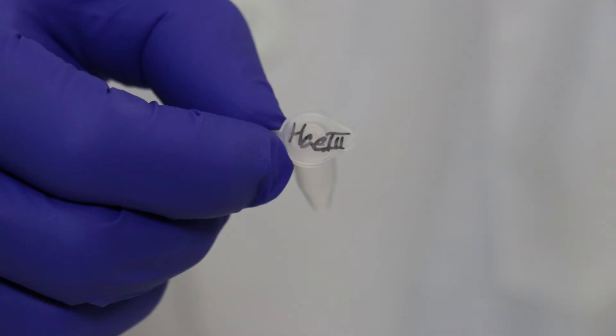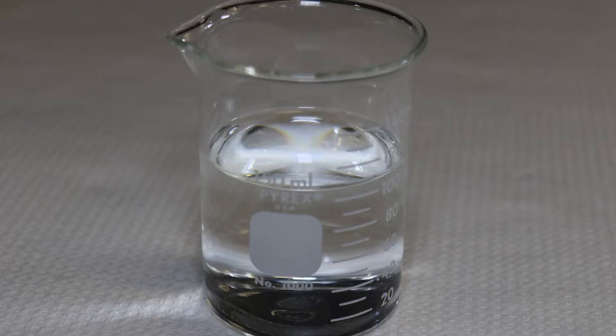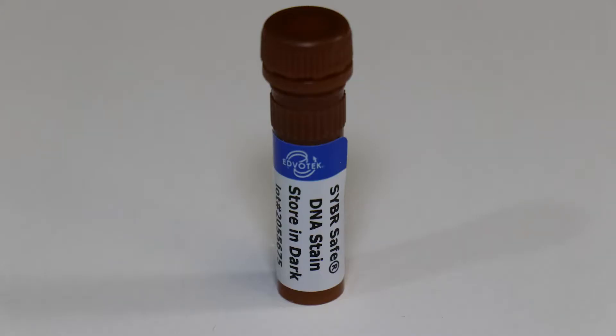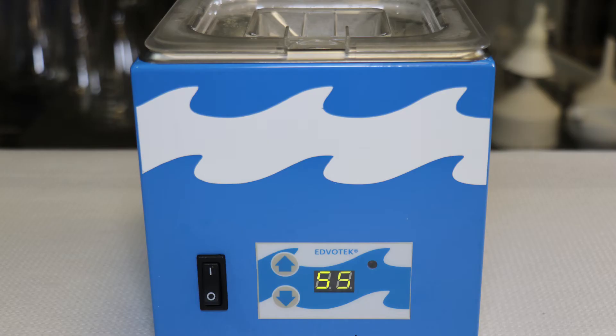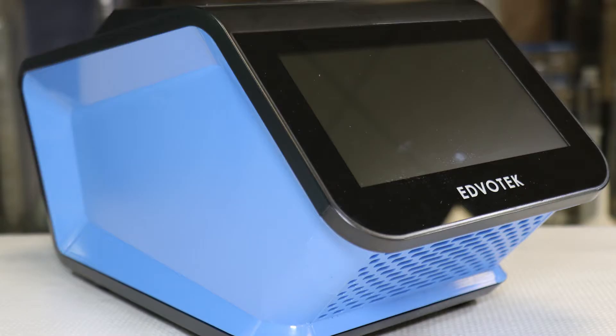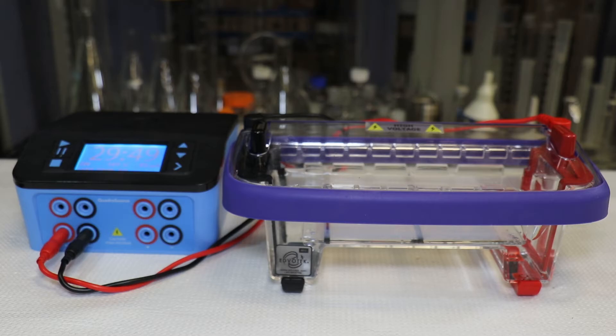One tube of Hae3 restriction enzyme, 1x TBE buffer solution, ultra spec agarose powder, cyber safe DNA stain, two water baths, one set at 55 degrees Celsius, the other at 99 degrees Celsius, a thermal cycler and electrophoresis apparatus with a power supply.